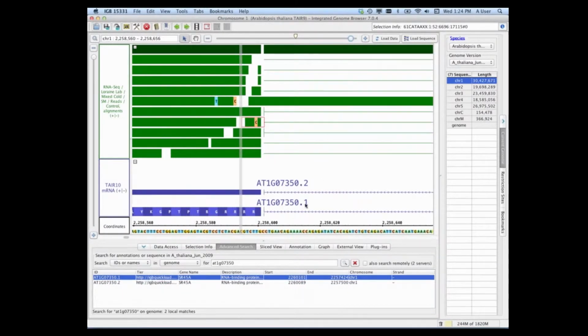You can see all of the nucleotides, again, as the individual letters. You can once again, within the gene model, see the amino acid translation. And now when we zoom in on the read, what you can see is only the letters where it does not match the genomic sequence.